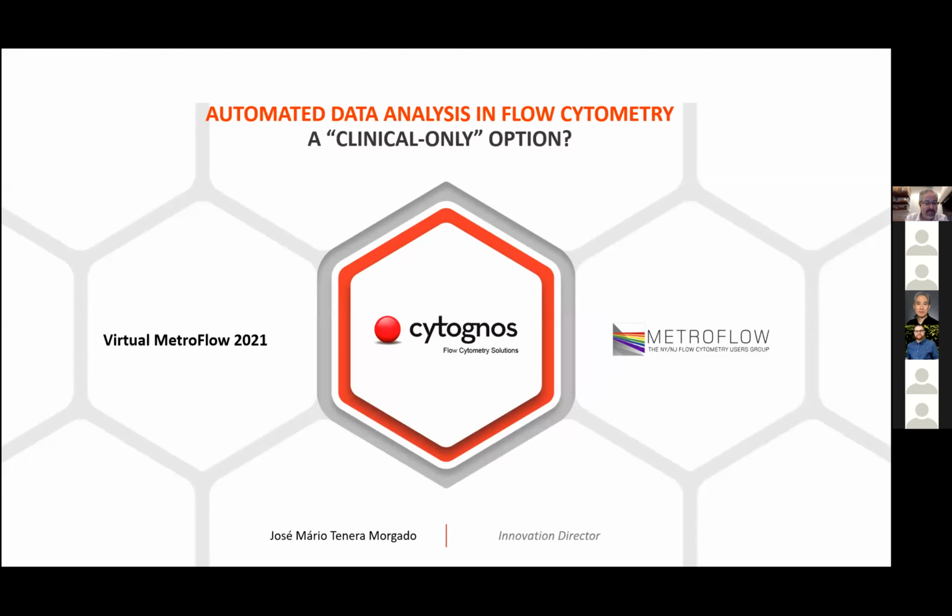So more than trying to talk about a specific product from our company, I would like to raise a question about the need for automated analysis tools for the new generation of flow cytometers with a lot of new parameters, like the spectral ones.